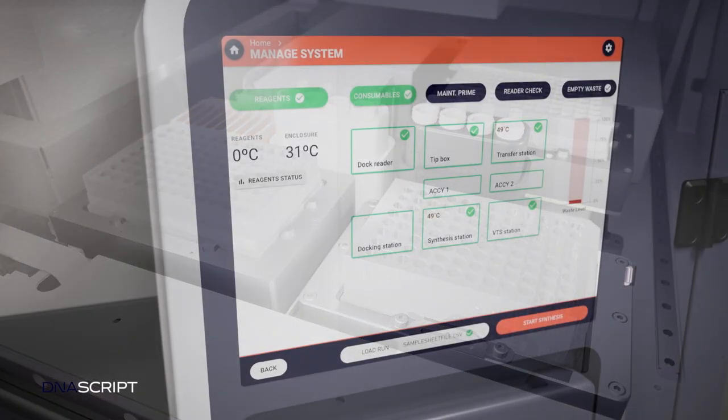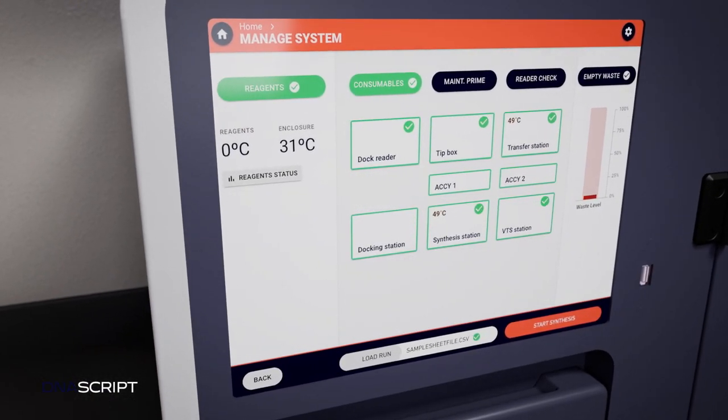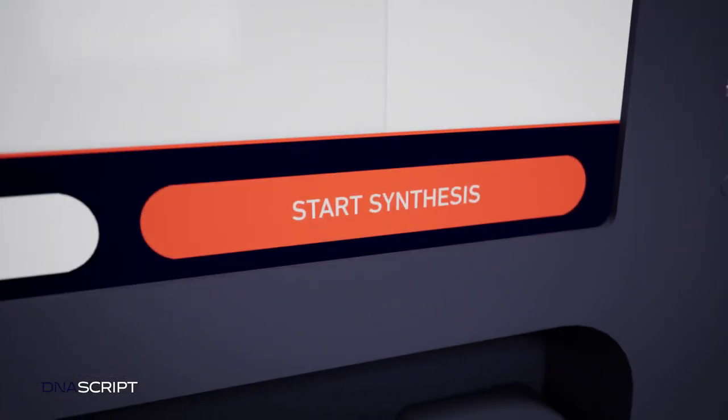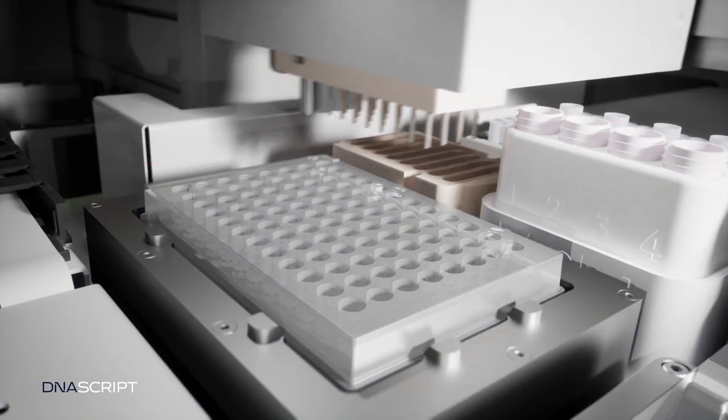The Syntax system is now ready to print your oligos. Simply press the Start Synthesis button and walk away.